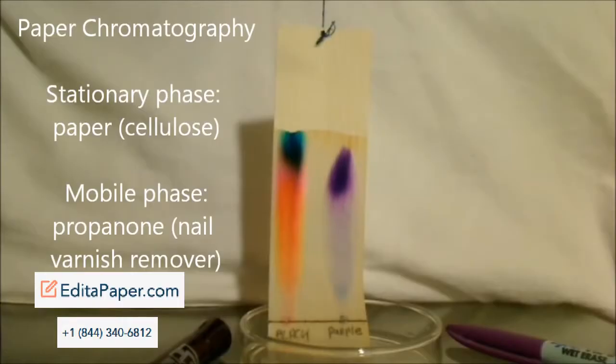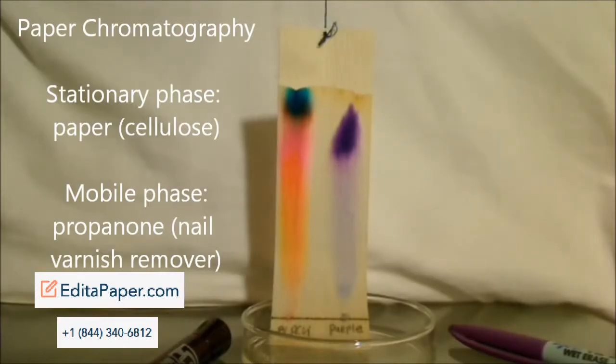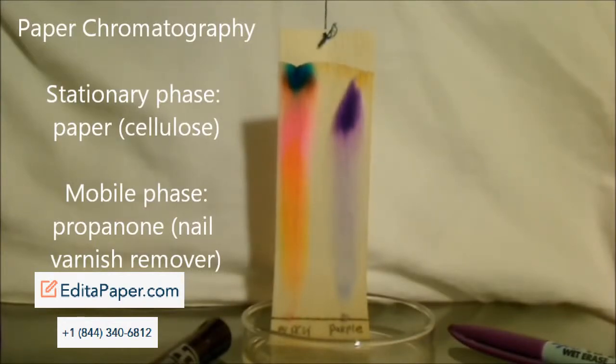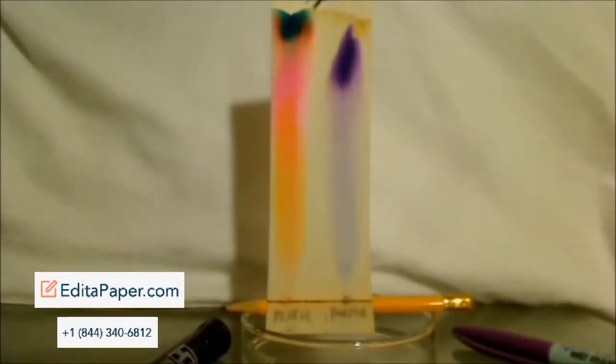colours. So looking at the purple ink, that prefers to be dissolved in the mobile phase, so it's going up quite high. The orange component of the black ink, well, that's not moving up very much at all compared to the others, so that one would rather be in the stationary phase. So it's not so easy to do this.